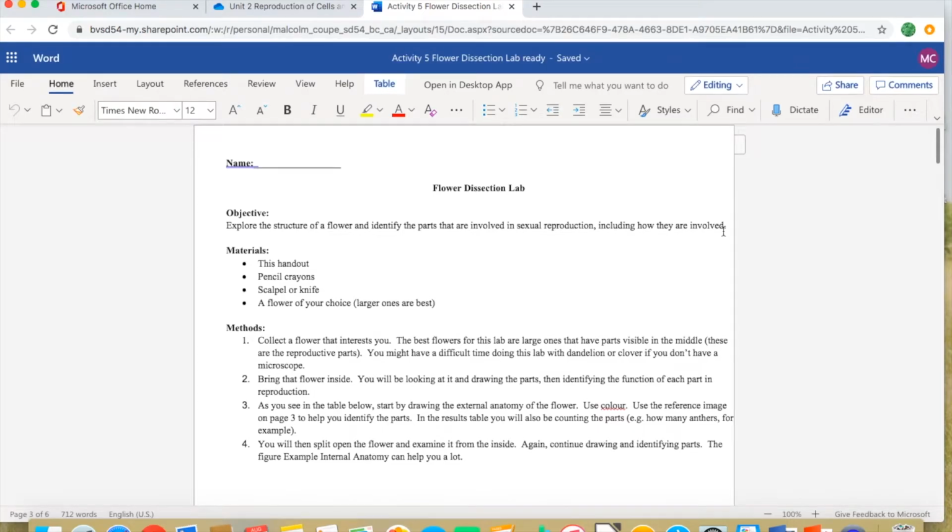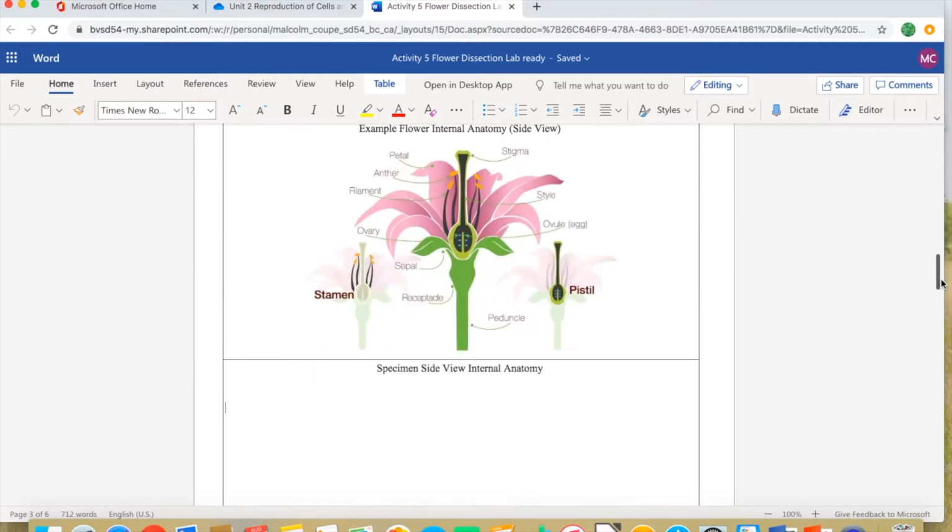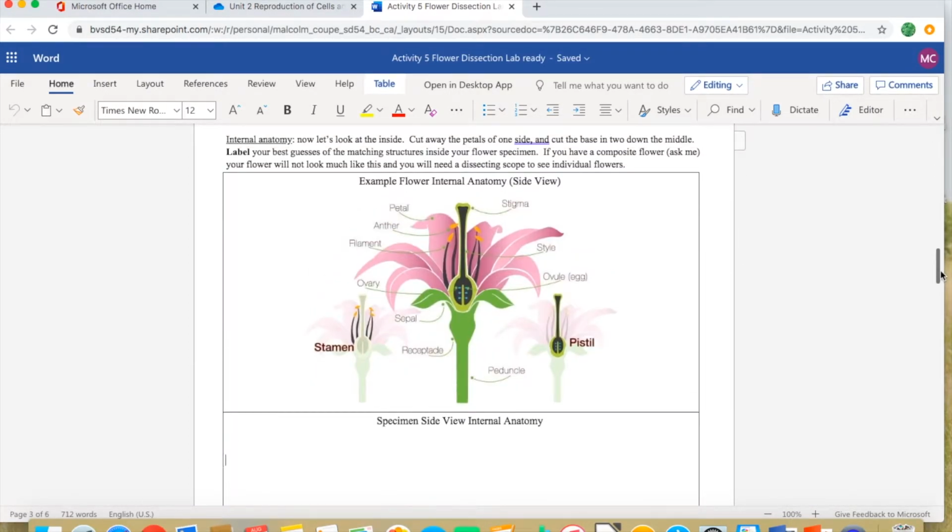Hi there, this is the video for the Flower Dissection Lab. The purpose of this lab is for you to explore the structure of a flower and to identify the parts in it that are involved in sexual reproduction, including how each of those parts is involved in reproduction. So we'll get started with this.